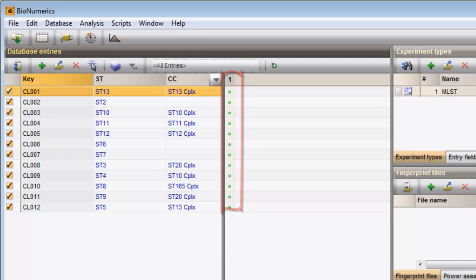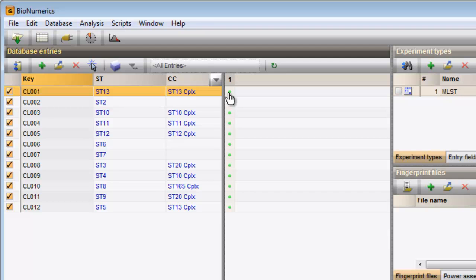A colored dot is displayed if character information is linked to the entry. To view the character information of a certain entry, I can click on the corresponding colored dot.